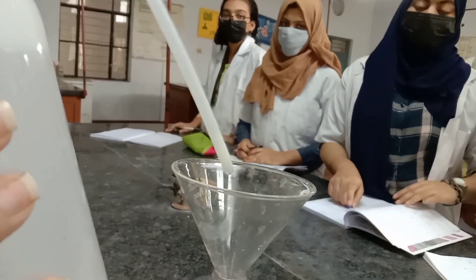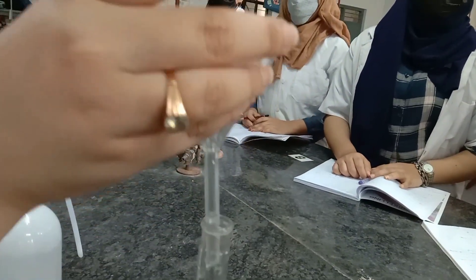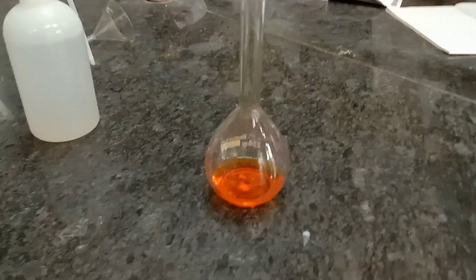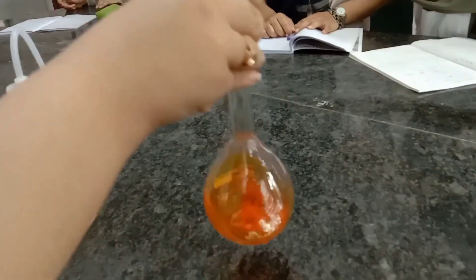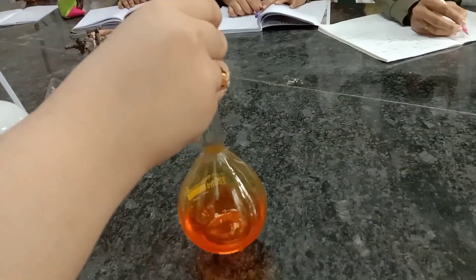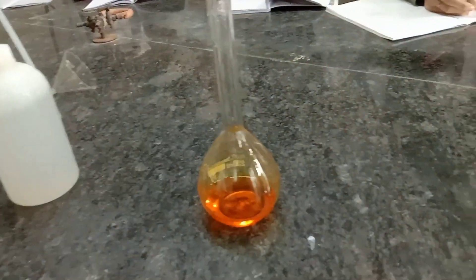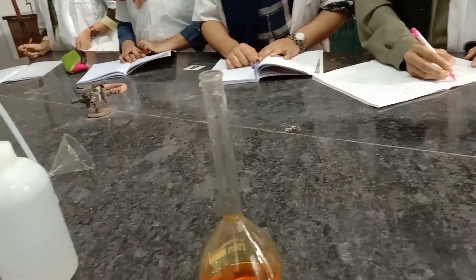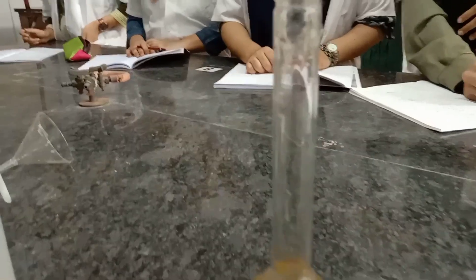Now remove the funnel and place it aside. First try to dissolve the substance. Now, is it a colored solution or a colorless solution? It's a colored solution. So which meniscus has to be checked? The upper meniscus. You can check the mark — I will show the mark.